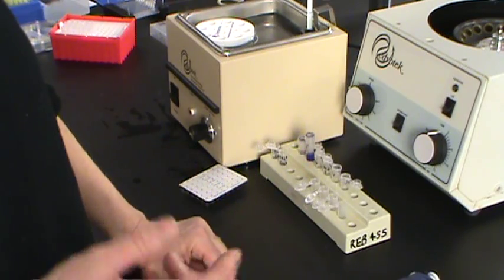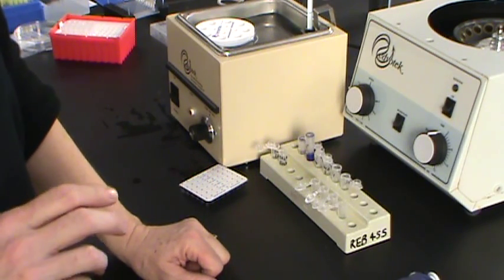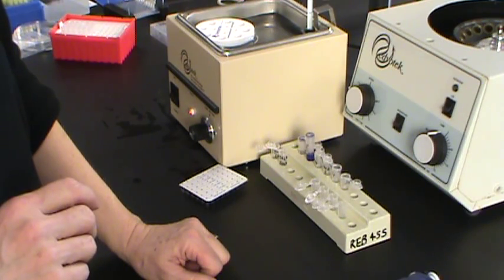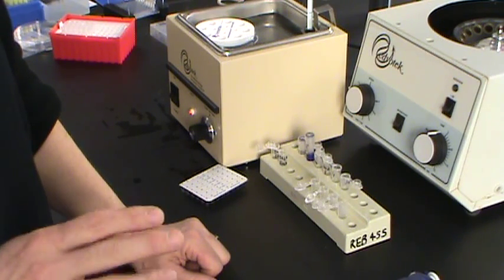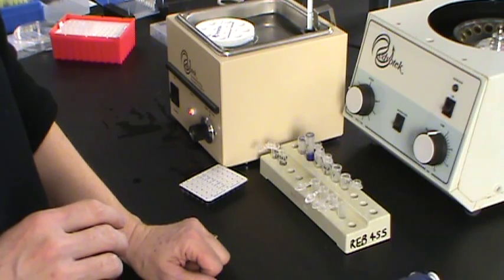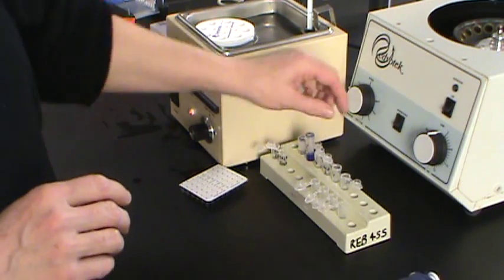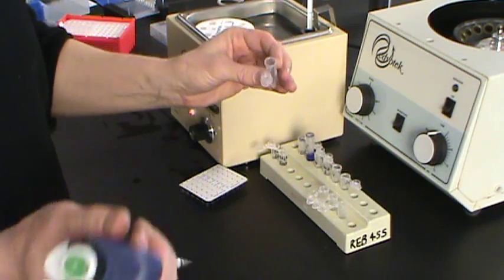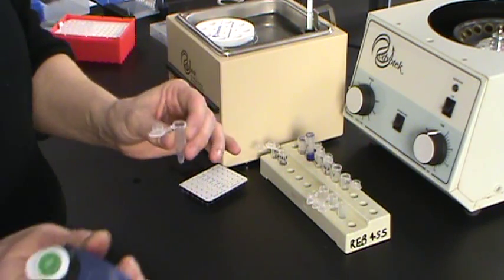But you'll have 4 of them. Your suspect DNA will be treated with 2 different restriction enzymes, each of which catalyzes the hydrolysis of DNA at a different site.